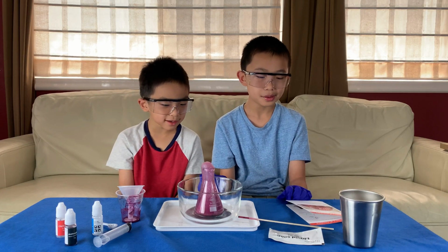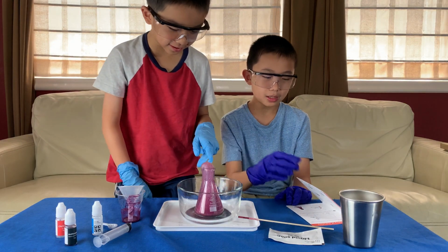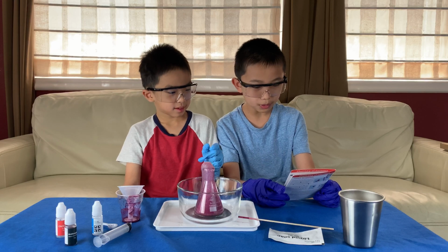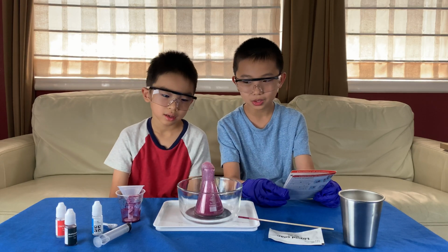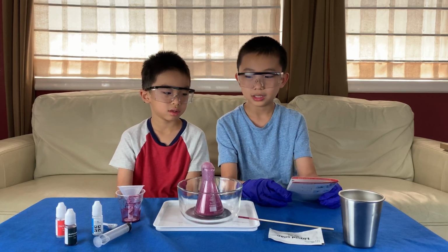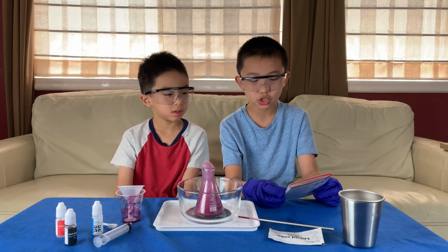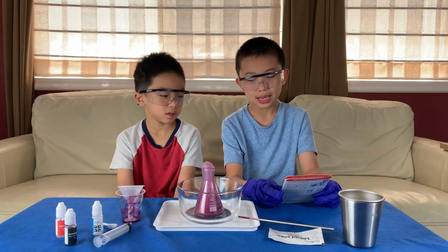Come on, just hurry up. Wait, it's starting to go to the second level. So now we have to start thinking about disposal. Dispose of solid waste together with household garbage, okay? So solid waste will be like the disposable cup. And then pour the solutions down the sink. Wash with an excess of water.